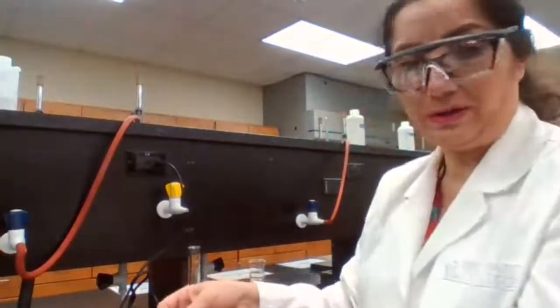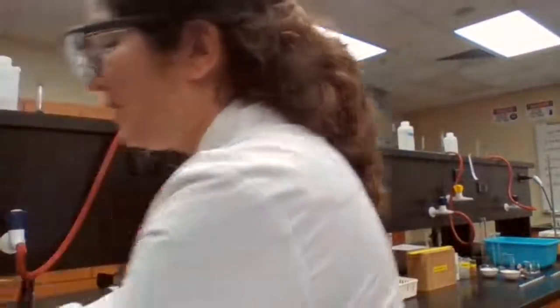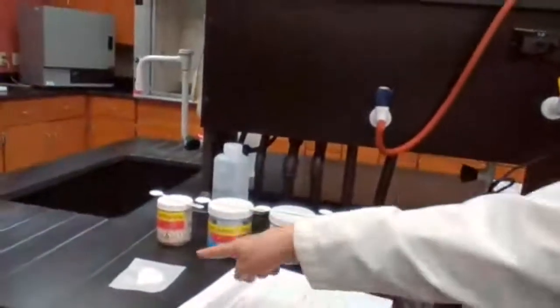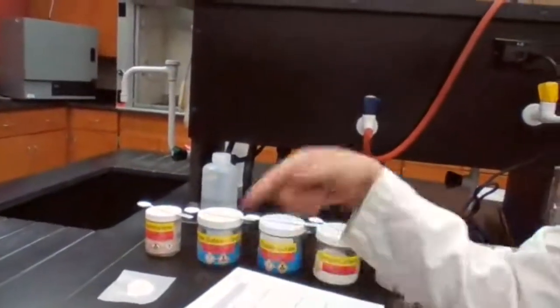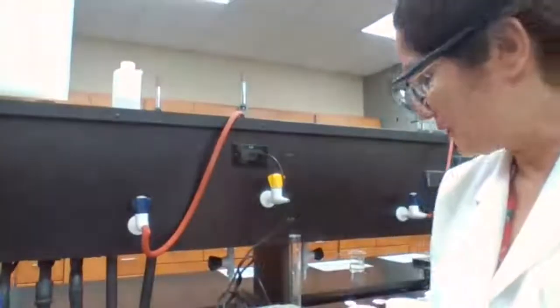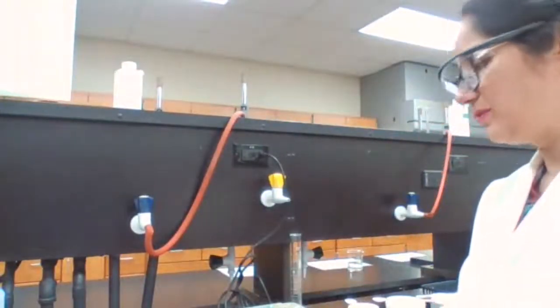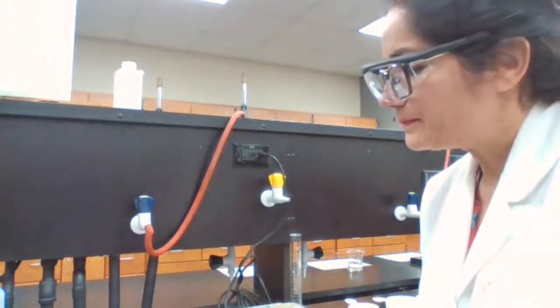If it gains water, how much water is it going to be? So I'm going to save this sample right there. It will be sitting on the bench for me, and later on, after 15 minutes, we will measure it again to make sure if there is a change in mass or not. So it's 2:51 now. If I remember exactly, in 15 minutes, I will measure it again.